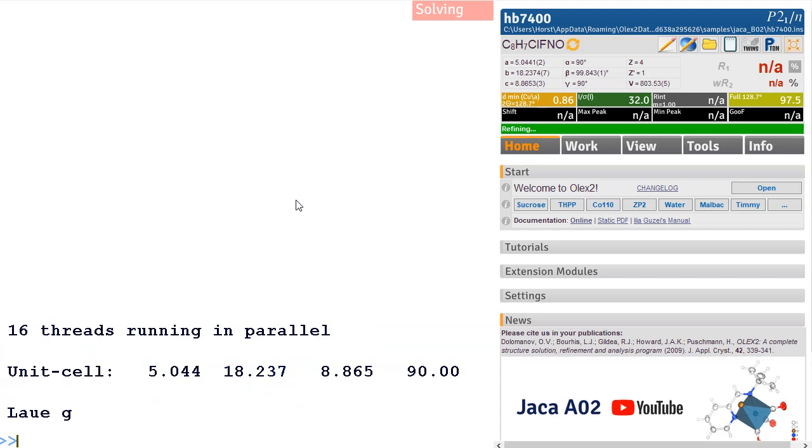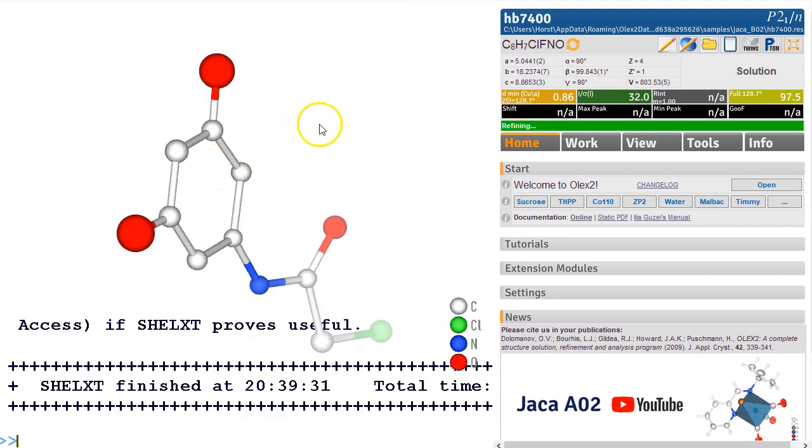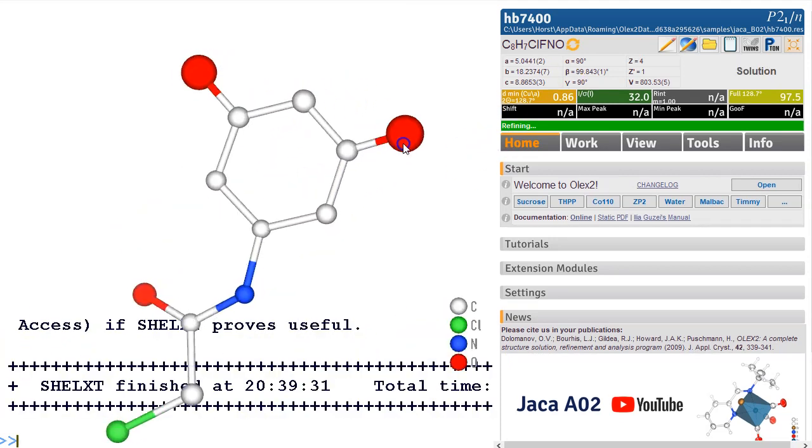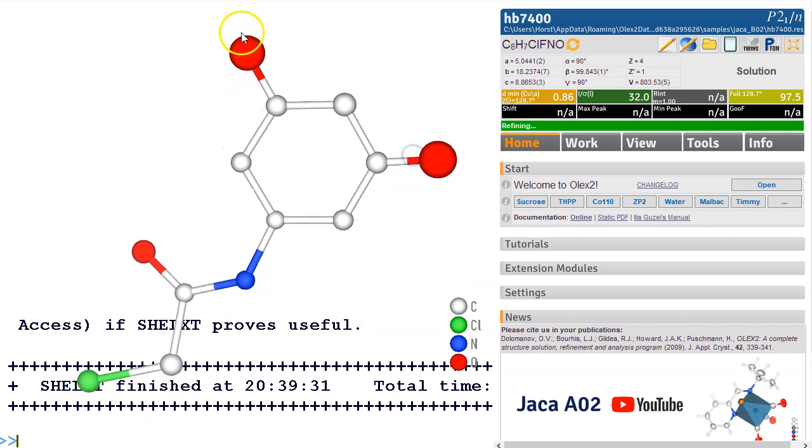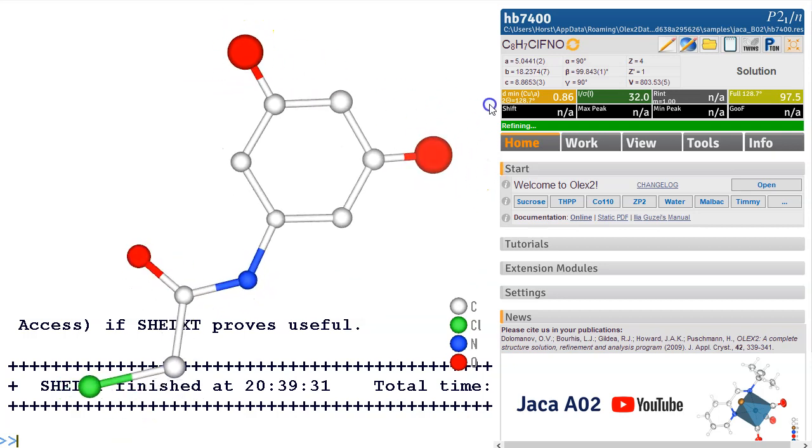Anyway, we can solve and refine and just carry on normally on this one. Right, it looks pretty good, we've got a structure here but these two oxygens are clearly a bit big. So Shelx XT thought they're oxygens and then on refinement they actually blew up a bit.